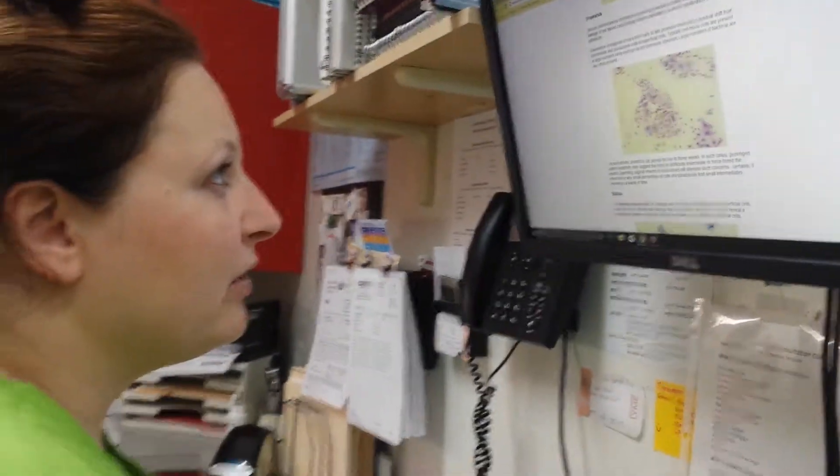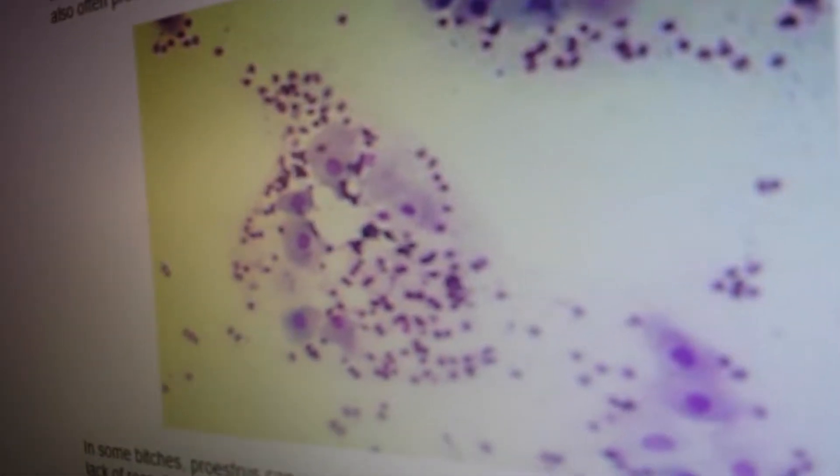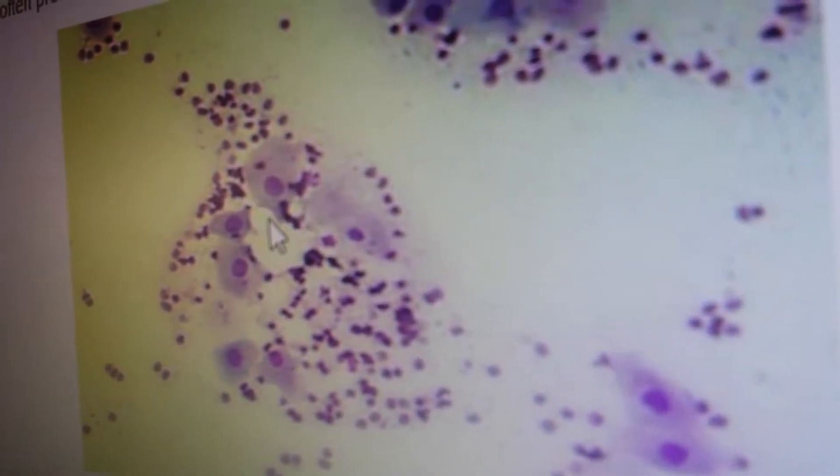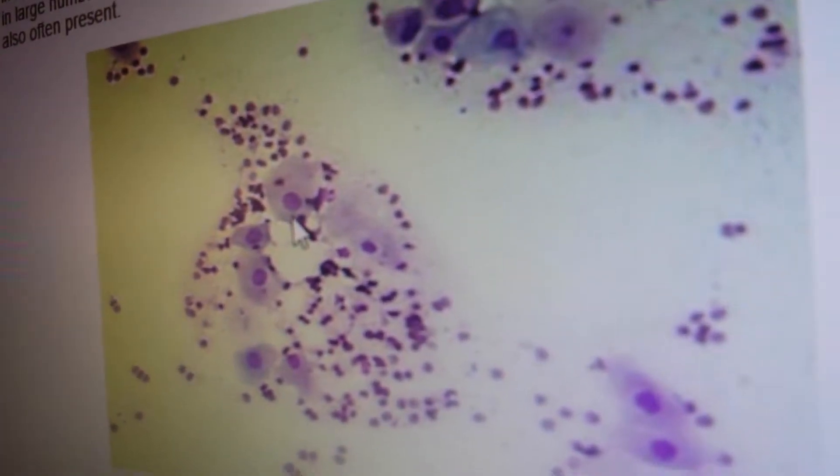The proestrus is when you would really start to notice with the patient that they have some drainage, possibly a little bit of bleeding. So as you can see there's different cell types in here. You're going to see a lot of red blood cells and lots of large neutrophils as well.